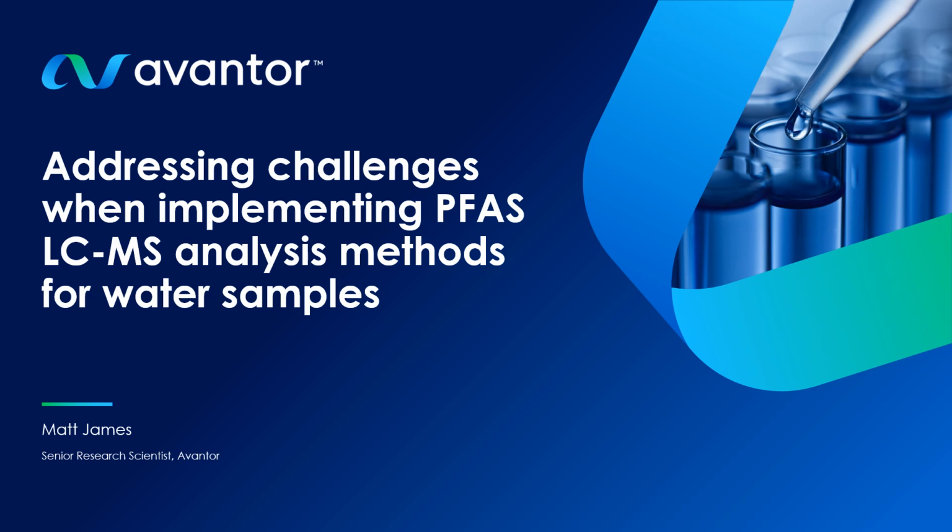Today we're talking about addressing challenges when implementing PFAS LCMS analysis methods for water samples. And I'm very pleased to be joined by Matt James, who's going to do the presentation for us today.